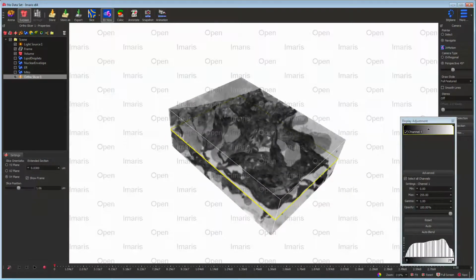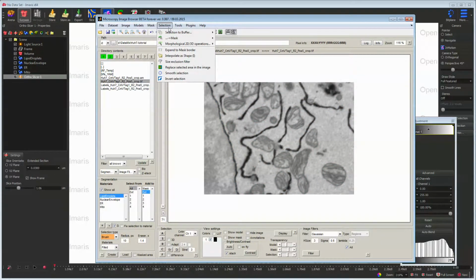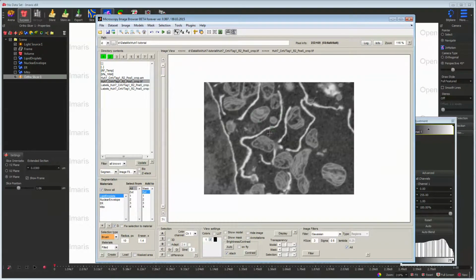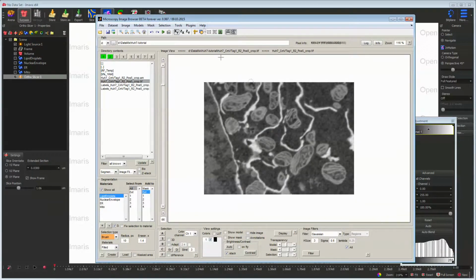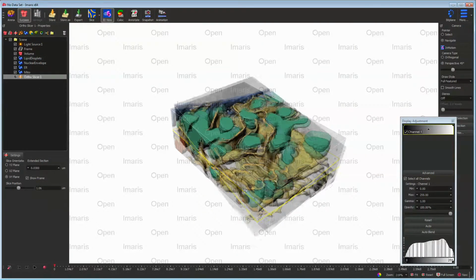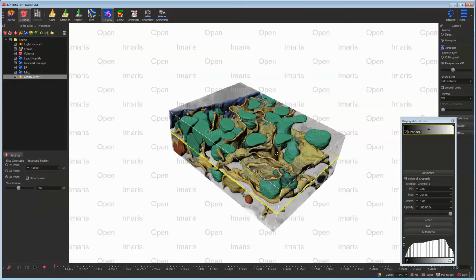Alternatively, we can invert the image here, for example using the Ctrl+I shortcut, and then send it like this. Then it would probably be a little bit easier to visualize. So again, the model is ready and it can be used to make animations and any kind of snapshots.